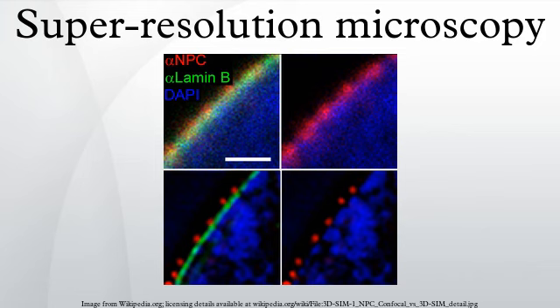In this case, Gustafsson achieves less than 50 nanometer resolving power, more than 5 times that of the microscope in its normal configuration. The main problems with SI are that, in this incarnation, saturating excitation powers cause more photodamage and lower fluorophore photostability, and sample drift must be kept below the resolving distance. The former limitation might be solved by using a different nonlinearity. The latter limits live cell imaging and may require faster frame rates or the use of some fiducial markers for drift subtraction. Nevertheless, SI is certainly a strong contender for further application in the field of super-resolution microscopy.